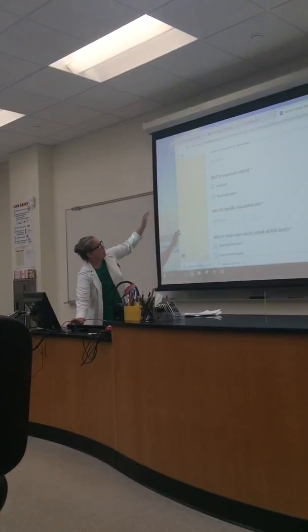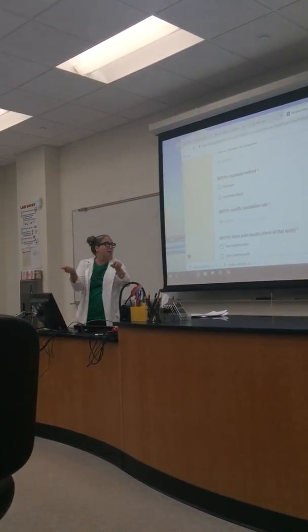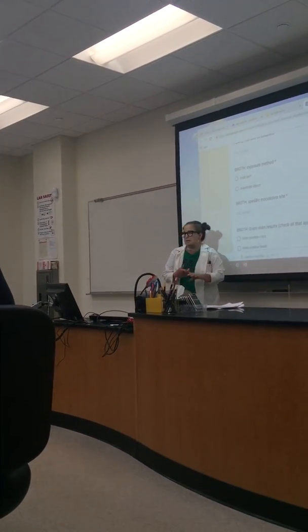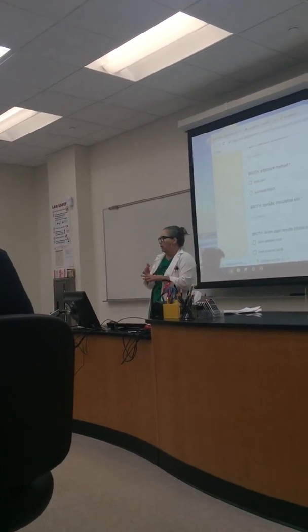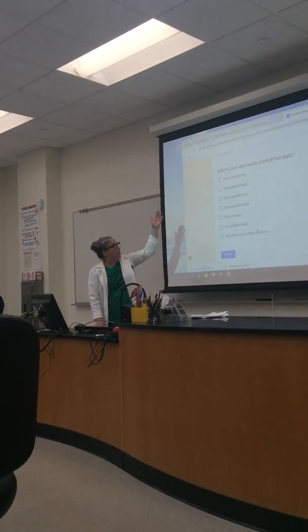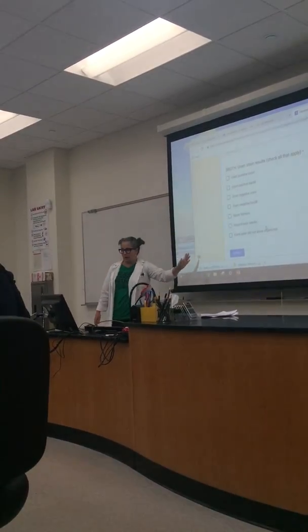And then broth, right, half of you rubbed a body part, half of you rubbed some inanimate object, so you choose one of those. And then you'll tell us the specific site. So my cell phone, the doorknob, my earlobe, wherever it was that you did that. And then you can check any or all of these, right? So you should at least check one thing.